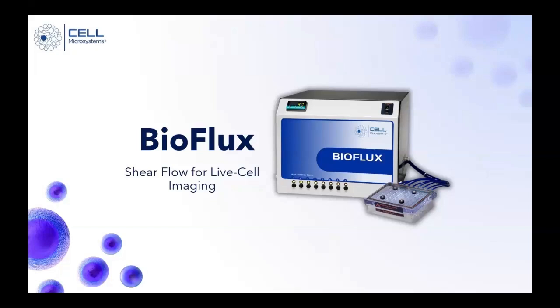Okay. Are there examples of using this with spheroids or organoids? So those tend to be a little bit bigger for the microfluidic structures of the plate. So again, it all depends on the size of what we choose to flow through the microfluidics of the plate.